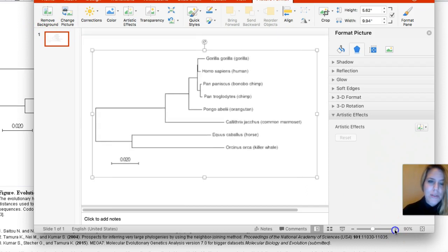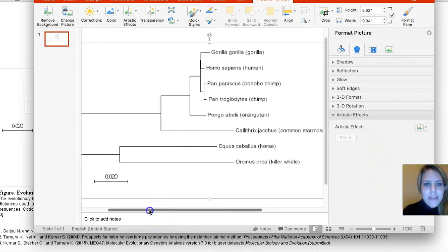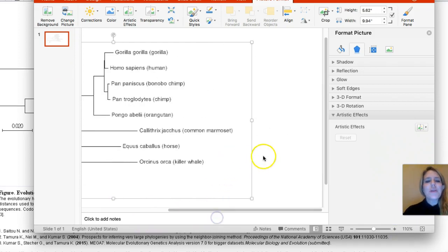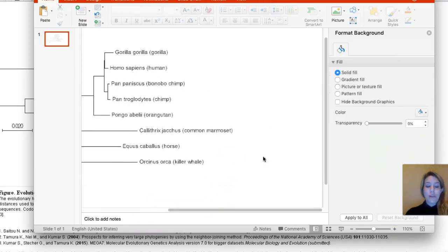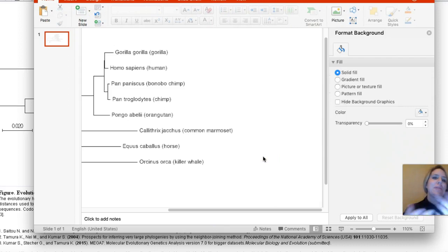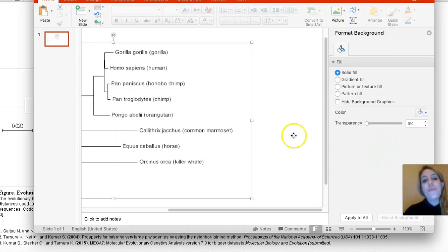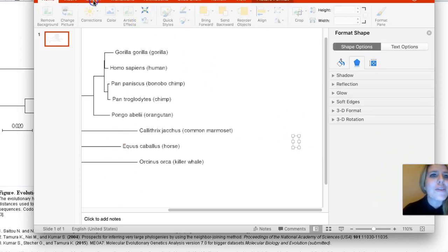I'm going to go ahead and make this thing larger so you can see it more easily. Now what we can do is we're going to go on to Google images and download pictures of each of these species so we can put them on either side here.